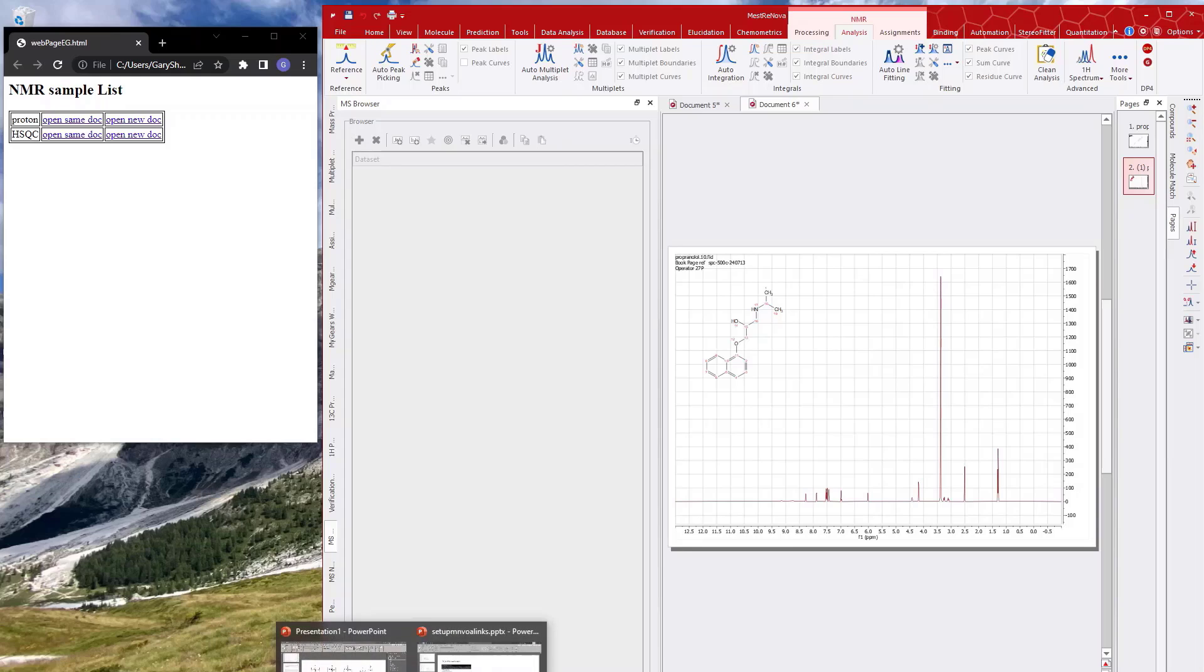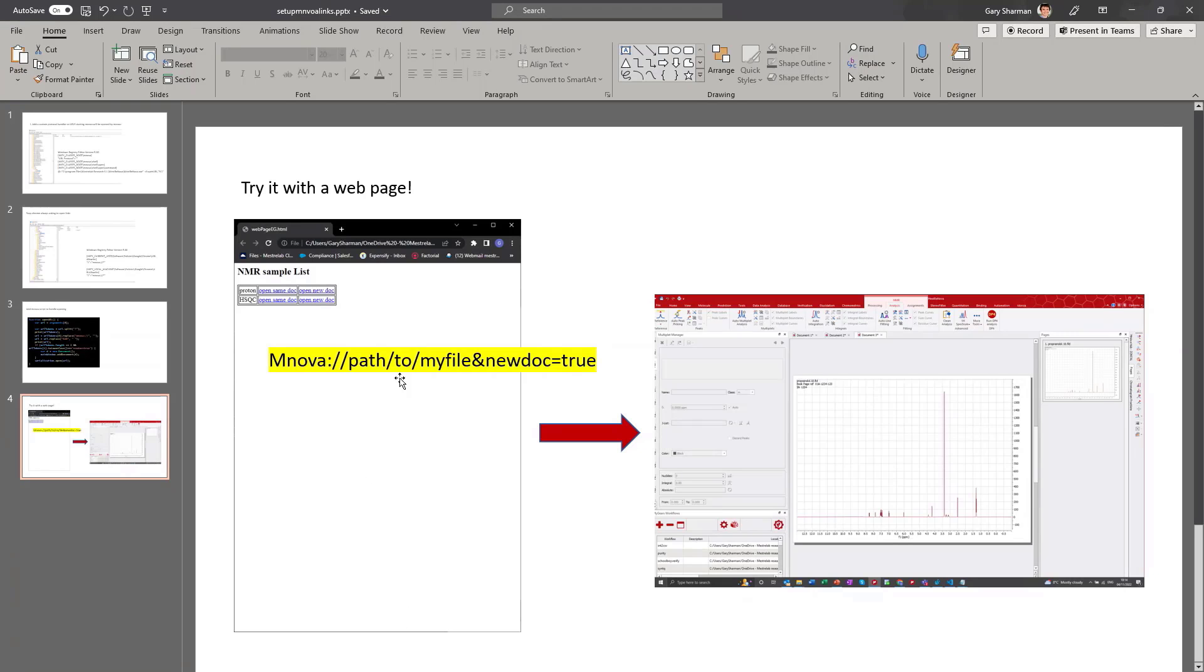So how does it work? Well, it works by having a link that starts with Mnova and then it passes a URL and some parameters which get Mnova to do what it needs to be able to do.